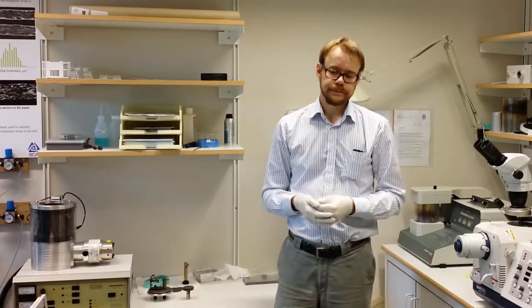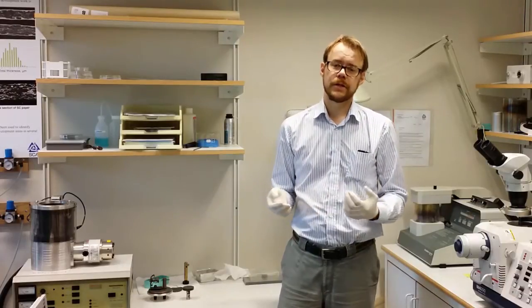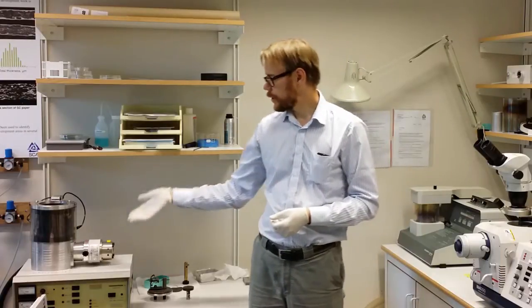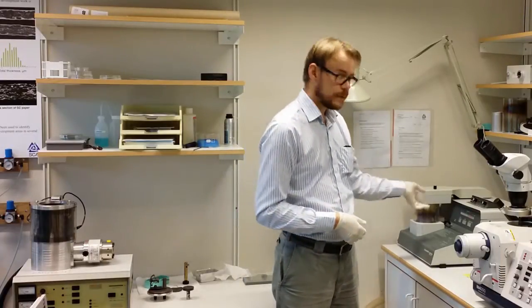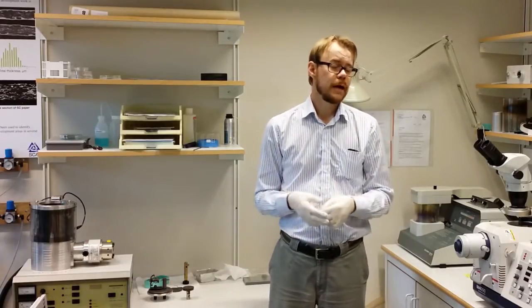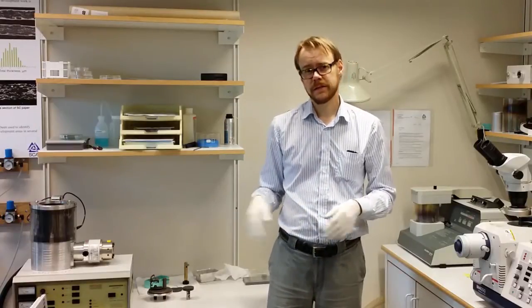Otherwise you will get problems. In order to make this layer you can use different kinds of machines, but the most common ones are a carbon evaporator like this one or a gold sputtering machine like this one. These are the most common. You can coat with other metals or use different techniques, but I think these represent the most common ones.